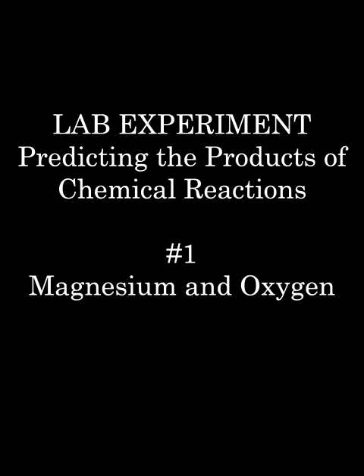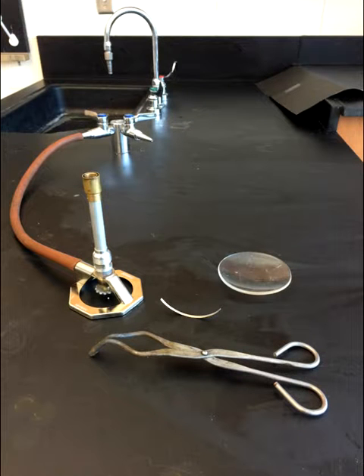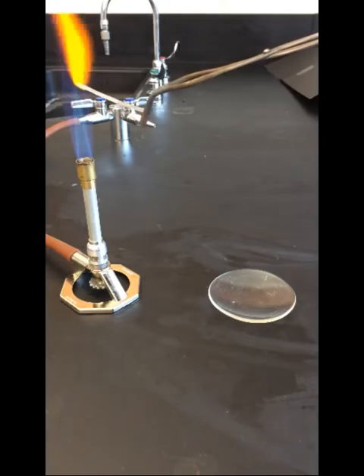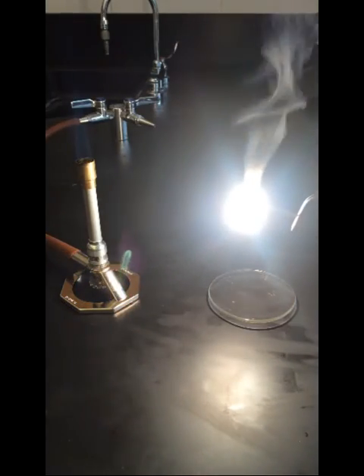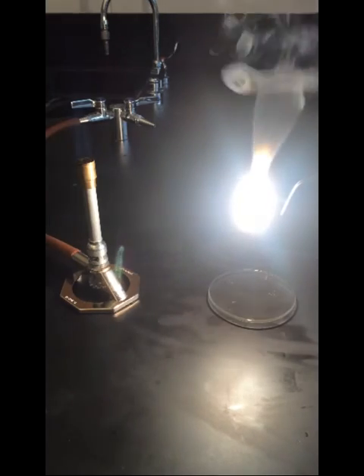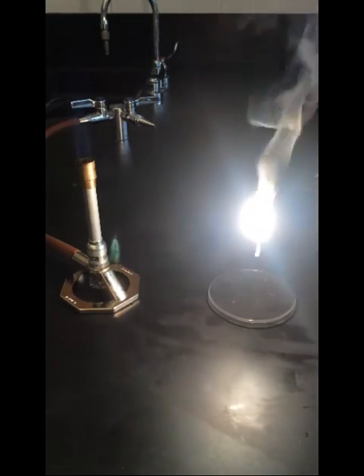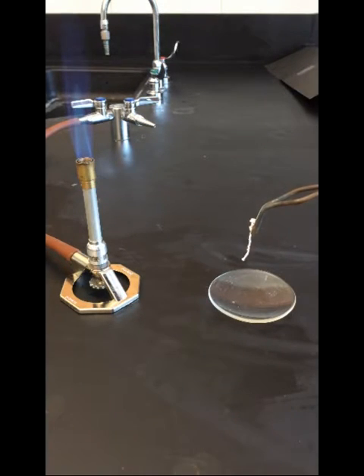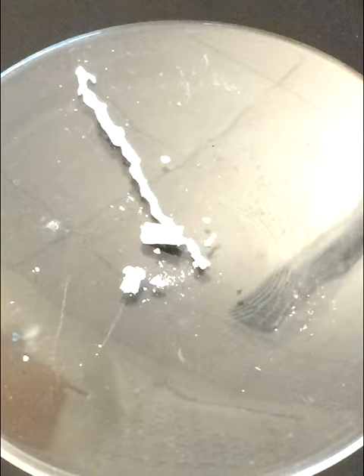In the first experiment, we will burn magnesium to react it with oxygen. Here's the equipment that will be used in this experiment. The Bunsen burner is turned on. The magnesium is held in the crucible tongs and then exposed to the Bunsen burner flame. It is allowed to burn over the watch glass completely. Notice that the magnesium has turned into a white, flaky powder.